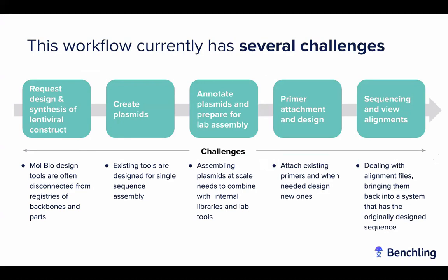There are a lot of pain points in this process. You might be doing this workflow end to end, but you might be using several tools to achieve this. Molecular biology tools are often disconnected from your central repositories or central registries of all the sequences that you have in your organization or in your company. Then creating those plasmids at scale versus creating them one by one becomes another challenge.